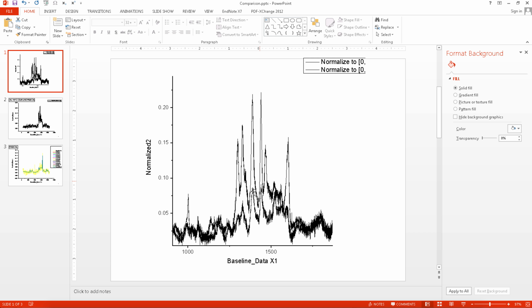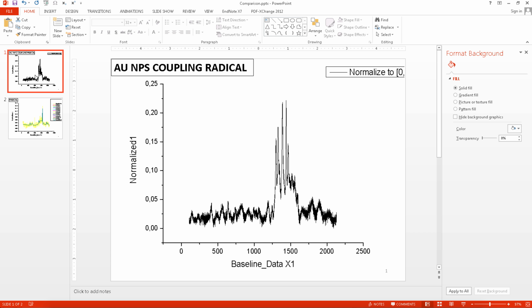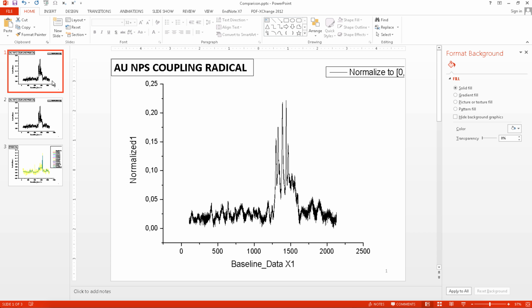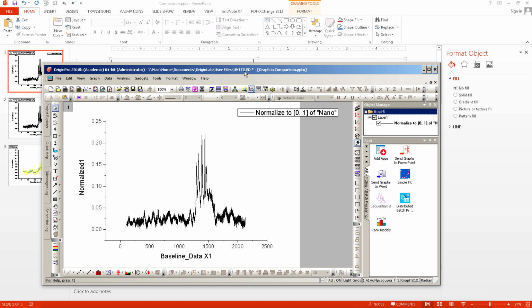Okay, so I already started here, taking these were the two that you got, and then I got to this point, but then I realized it's better if I do it all from zero, so that you can see and learn how to do it properly. I will duplicate this slide, and it's very good that you already have them in PowerPoint. So what I'm gonna do is put the two plots in a single graph.